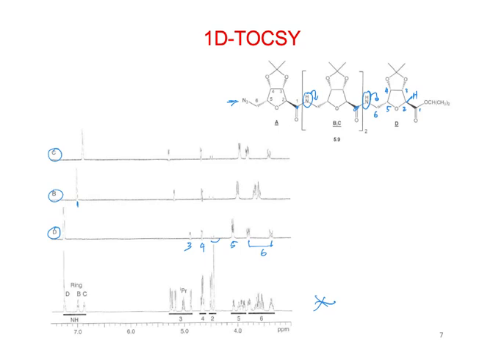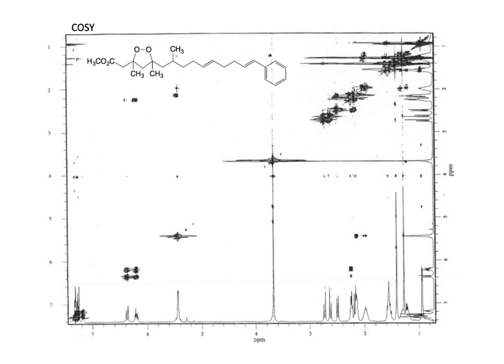Okay, so this has all been what we call the scalar coupling or the J coupling. The next one we're going to go to is going to be about the NOE. So I'm going to start with this. This was a compound that I worked on when I first started my academic career. I isolated this compound from a marine sponge, and we were trying to determine the structure.